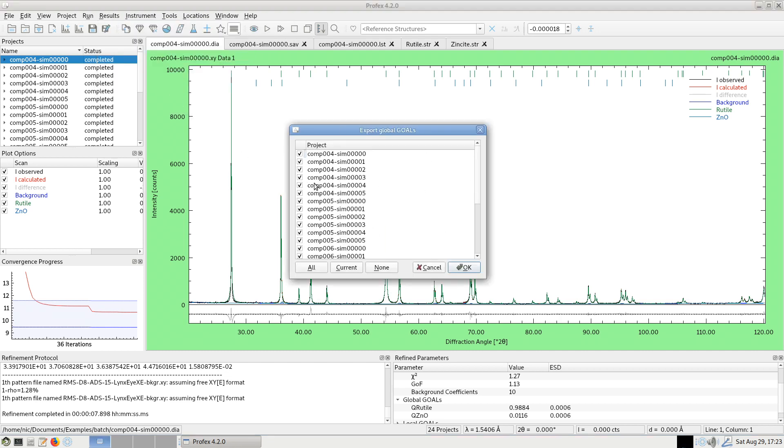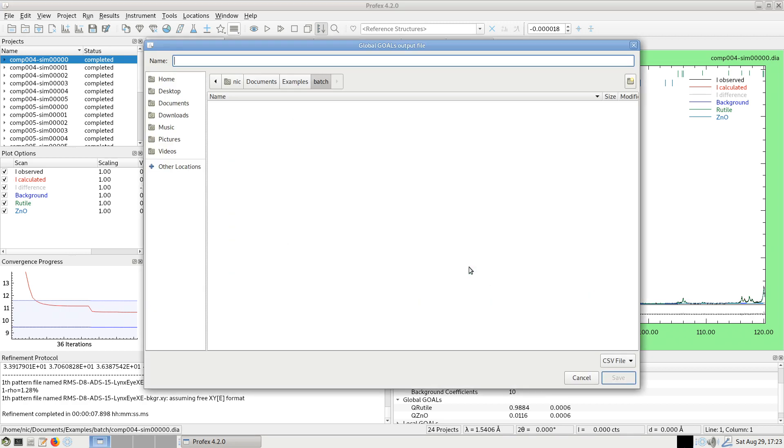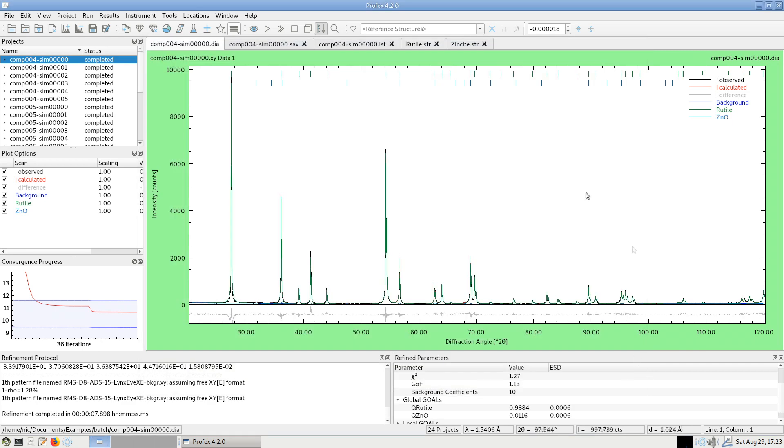I can again select which of the project results I want to export. Everything will be exported to the same file. I will choose all of them and give it a name, for example, quantities.csv, comma separated values file. Save.